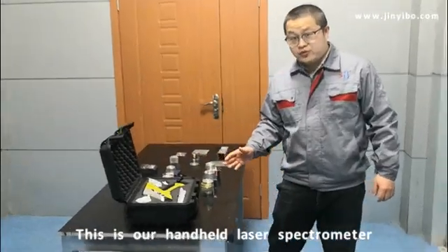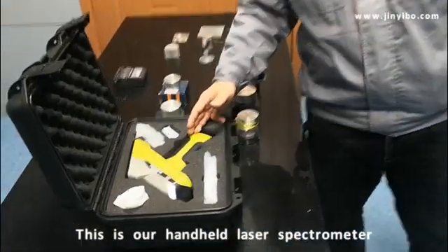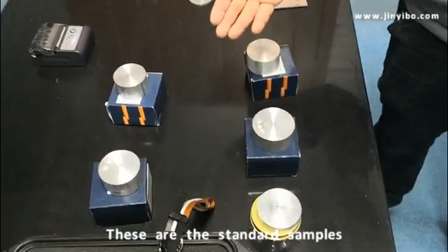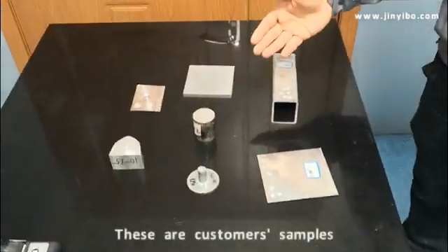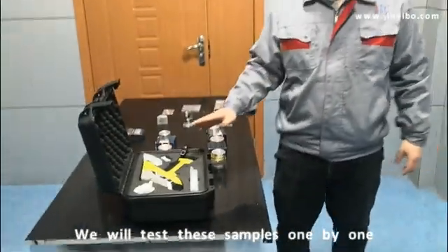Today we will show you the performance of our laser metal analyzer, our LIBS. Here are the standard samples, here are the custom samples. We will test them one by one to show you the performance of our LIBS.